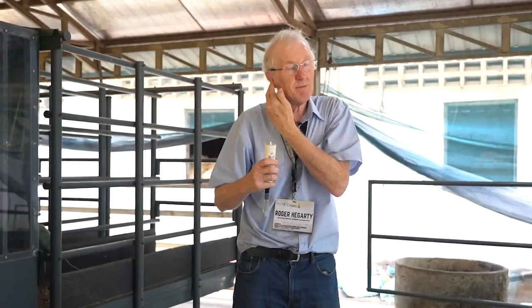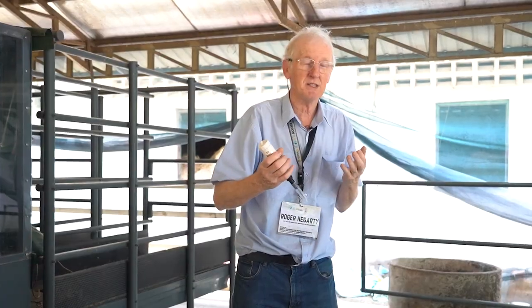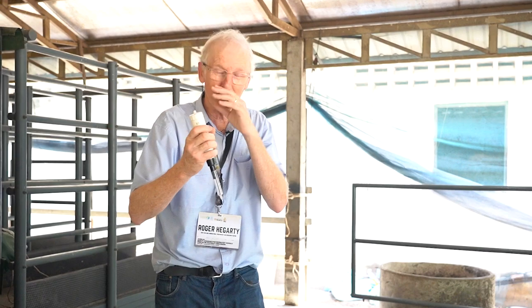The other thing that is important in there was you mentioned temperature and pressure. Let me say, if you are making your own temperature and pressure measurements, the more is better, but we have found 3 gives us a pretty good average for the day. Let me just say one thing about pressure in particular. Because we live on the Internet of Things, here am I in Phnom Penh, surely I do not need to measure pressure. I can get it from the internet, from the Bureau of Meteorology or something.